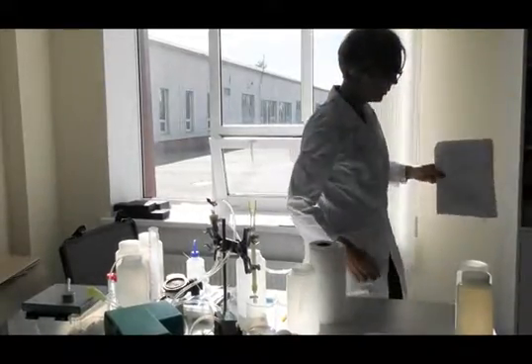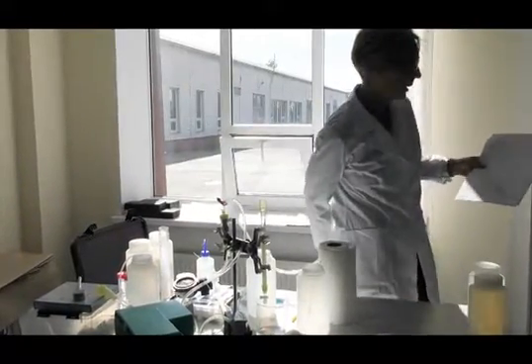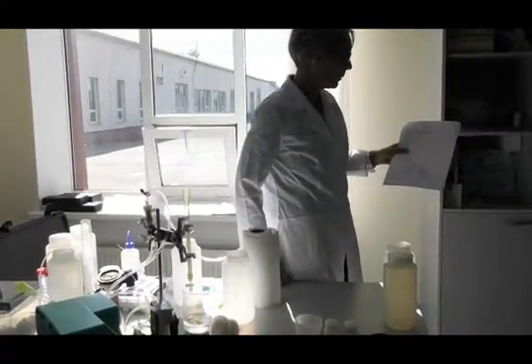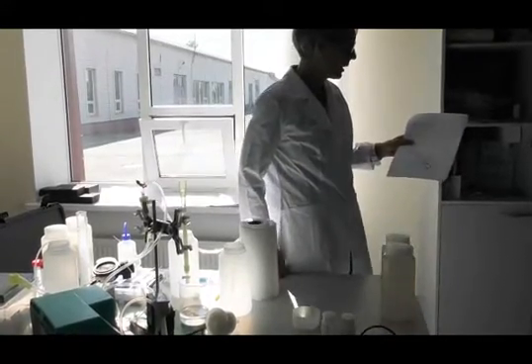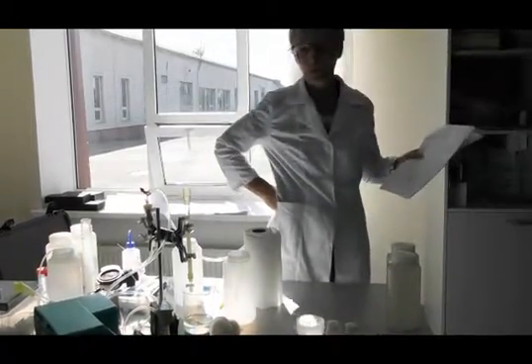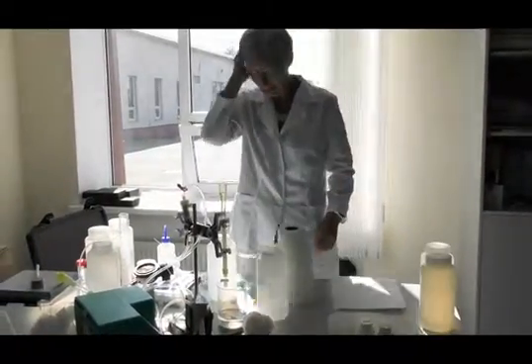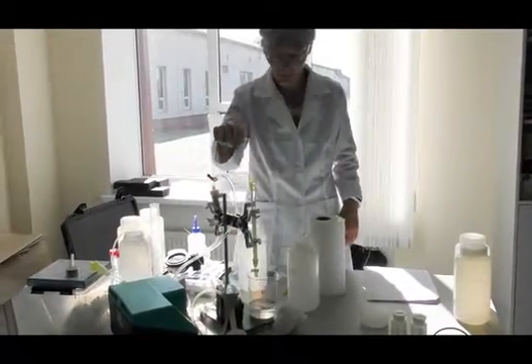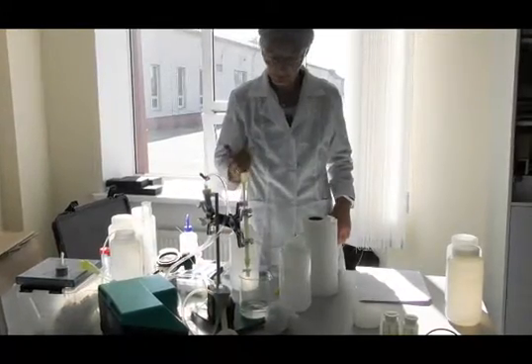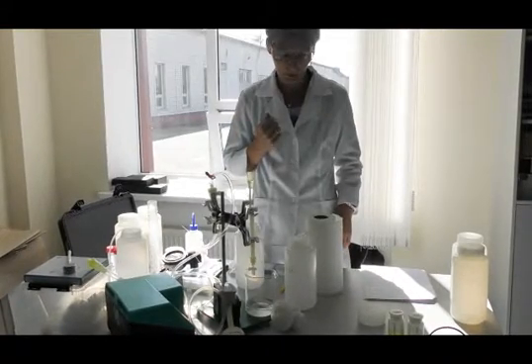You have probably seen this picture before somehow in this course. It tells what sizes we put the sample into. We split between particles, and particles are considered to be the fraction higher than 0.45 micrometer. So then we use filters to do that. In practice, that means we take the total sample, we put a filter, and then what's coming out in the other end of the filter is the 0.45 micrometer fraction.